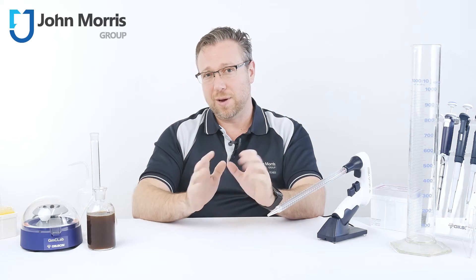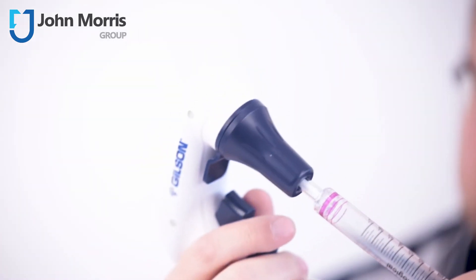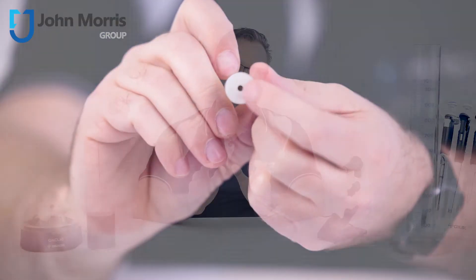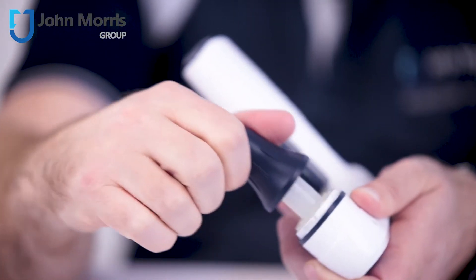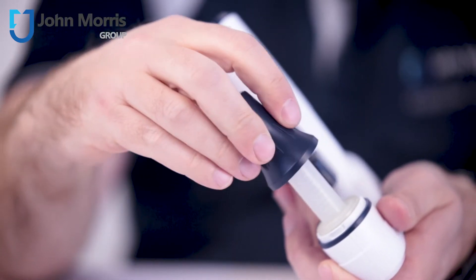The first thing we love about the new Gilson Macroman is the fact that it can take just about any seriological pipette on the market. There's no problem taking either glass or plastic bodied solutions, and because of the reversible silicon grip just above the HEPA filter, you can accommodate a wide variety of body sizes. Just under the nose piece, rotate a quarter click to the left and voila — reverse the silicon part here to fit your pipette.